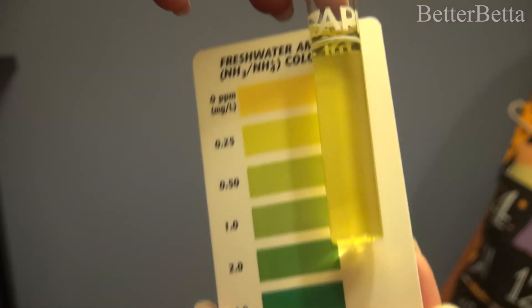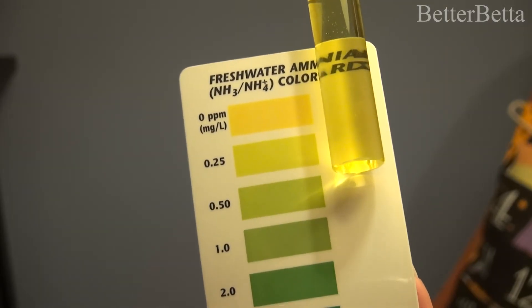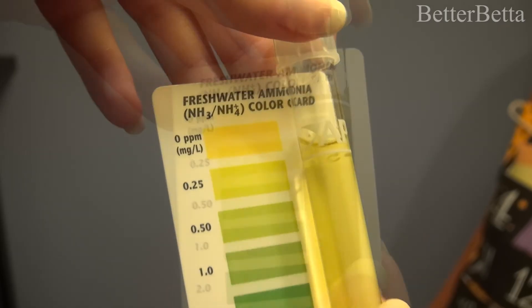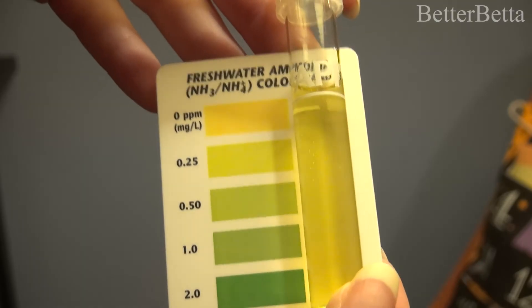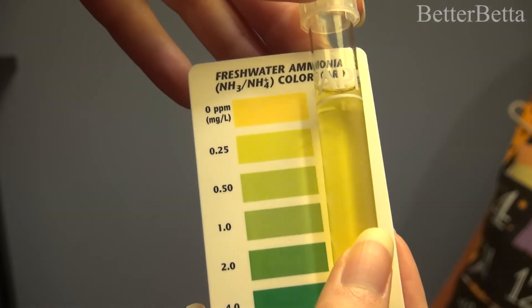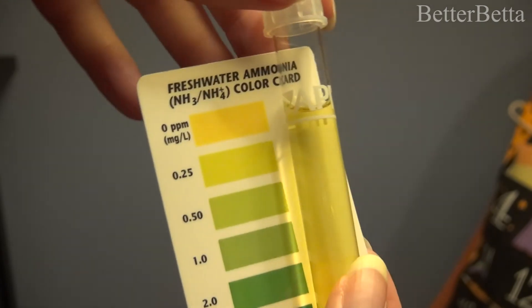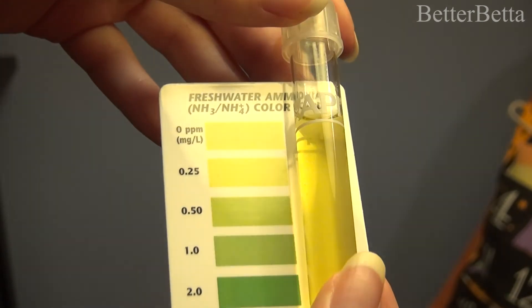As you can tell by my results here, my ammonia is not at zero, but it also is not a high amount — it was actually kind of expected though, because like I said, I'm at a new portion of my cycle and I'm due to clean my tank anyway. It is not quite the color of 0.25 parts per million, however it is definitely not zero either, so I would say it is somewhere in between, possibly 0.15. While this level is not going to cause immediate harm to my fish, it's definitely something that means an immediate water change is in order.